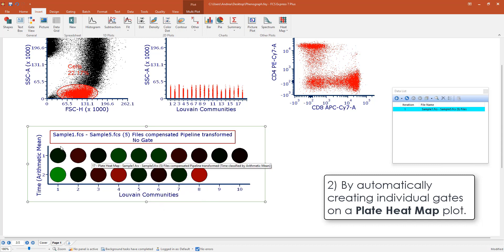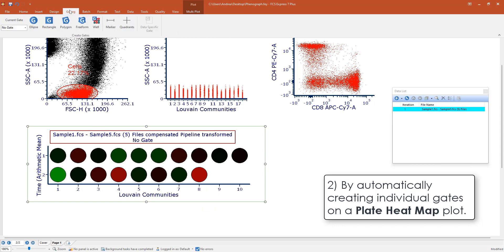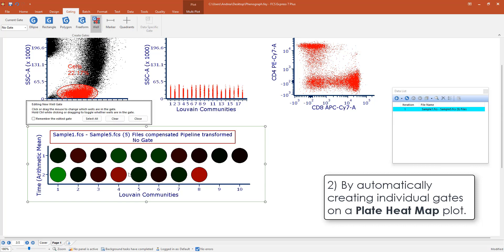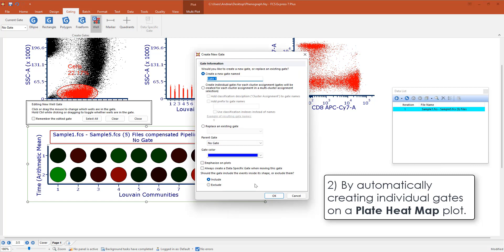In this case you see we have 18 clusters. A very interesting way of creating gates around those clusters is by using the well gate from the gating tab. Drawing the gate around all clusters and then select to create individual gates for each cluster assignment. You can customize the name.